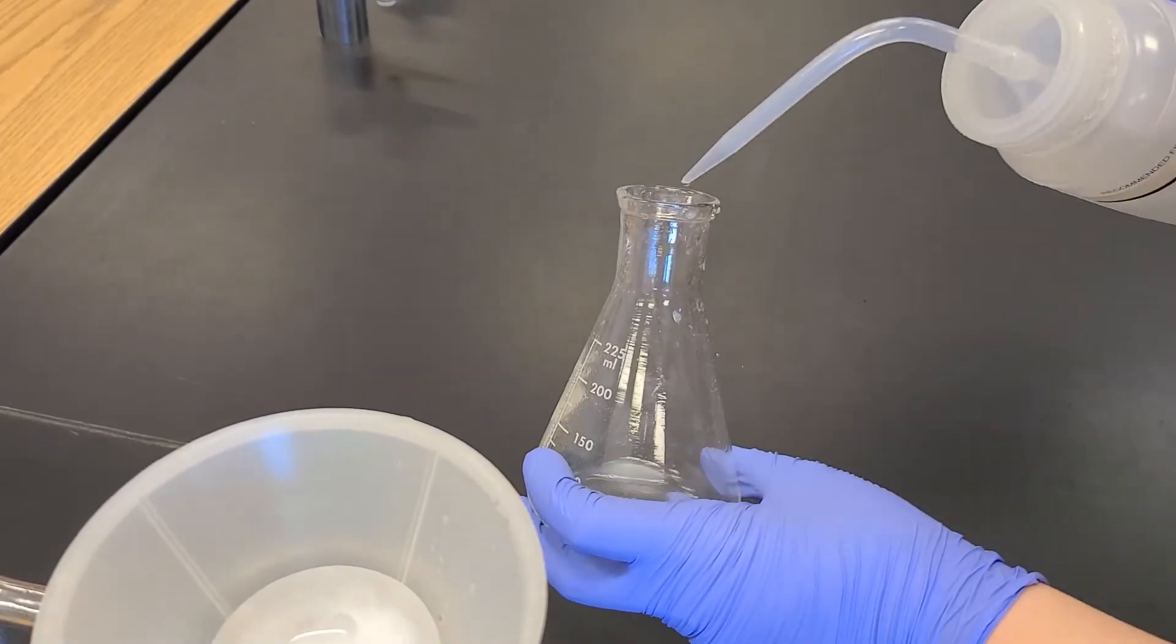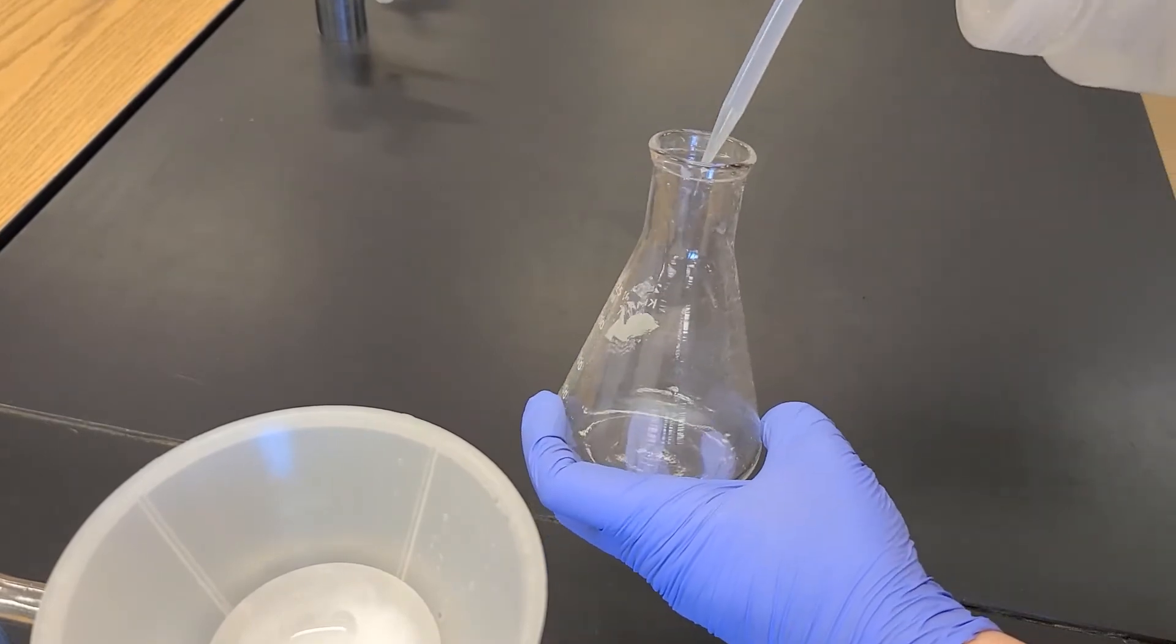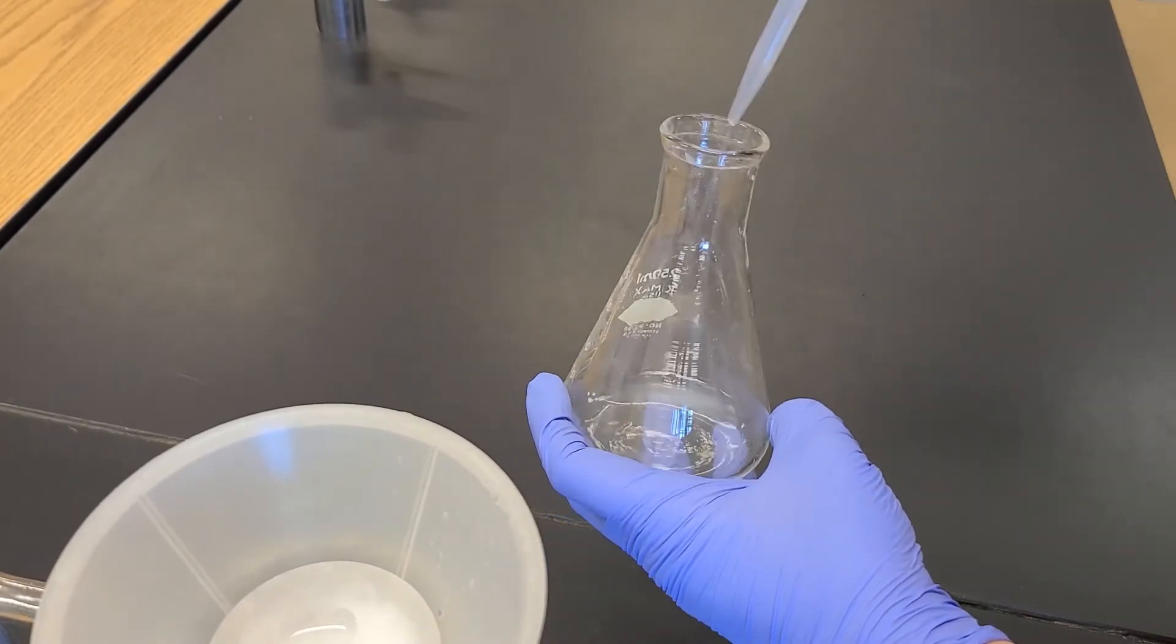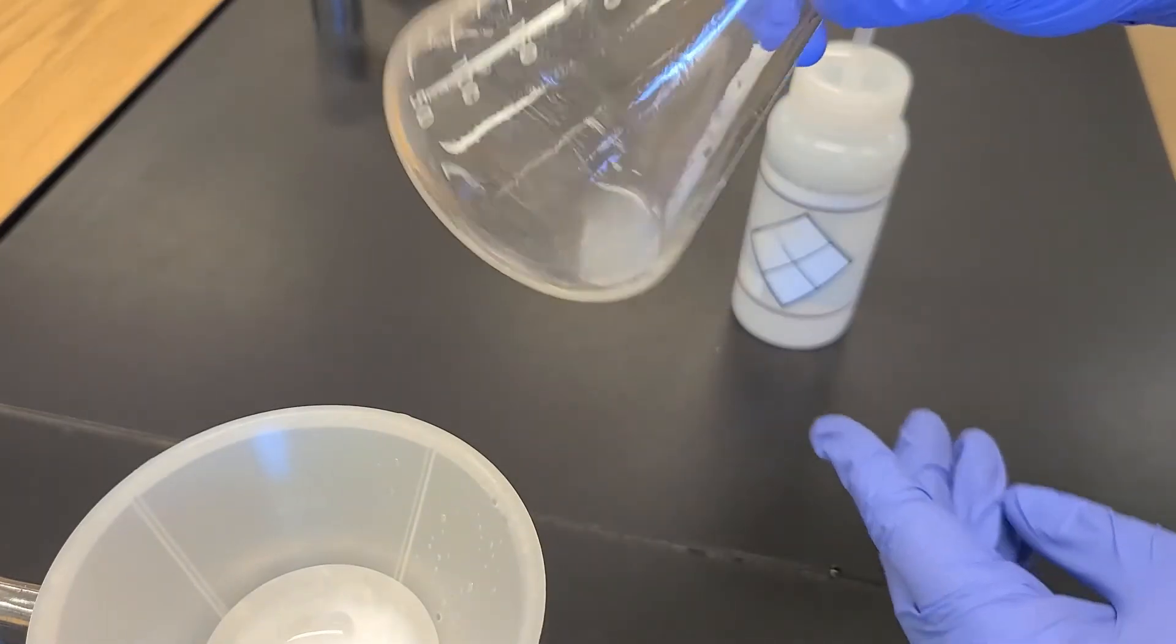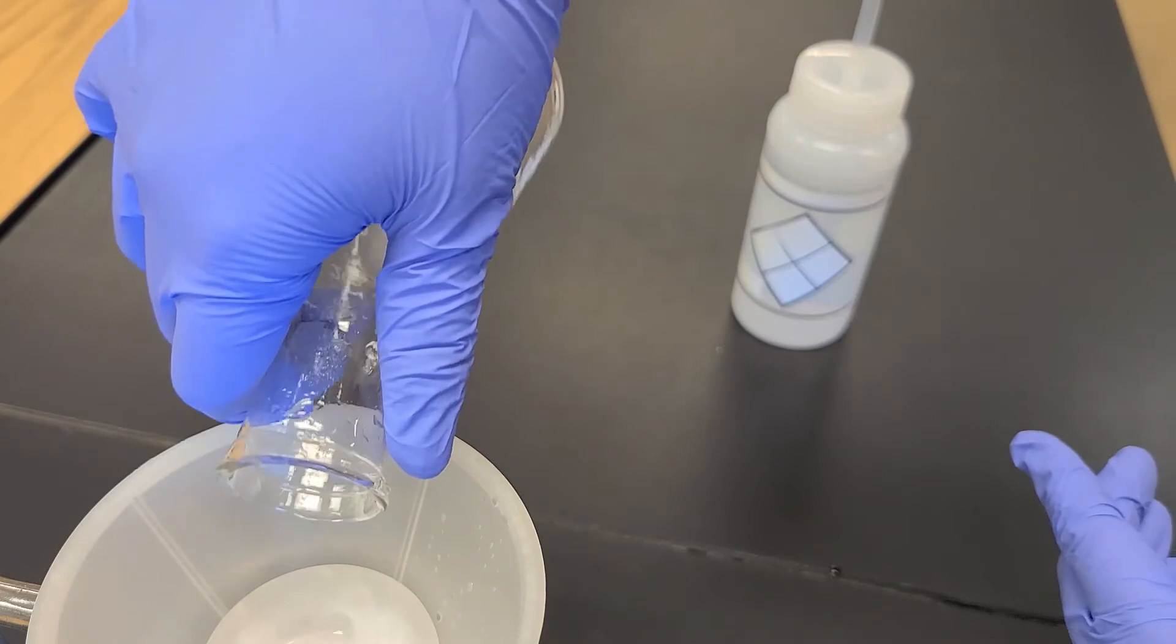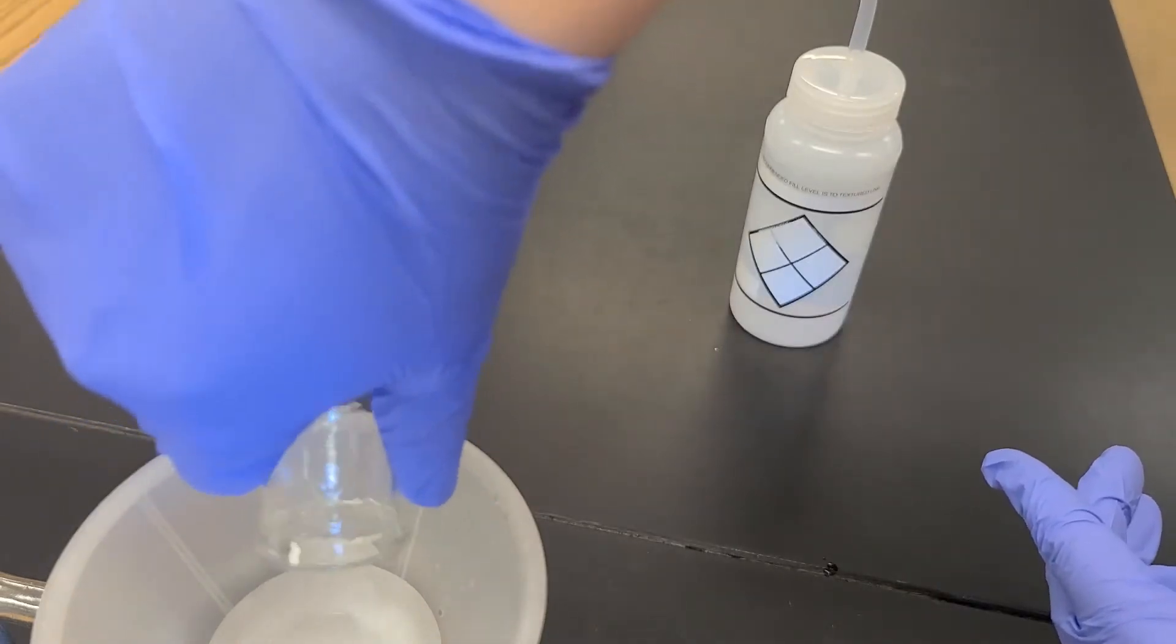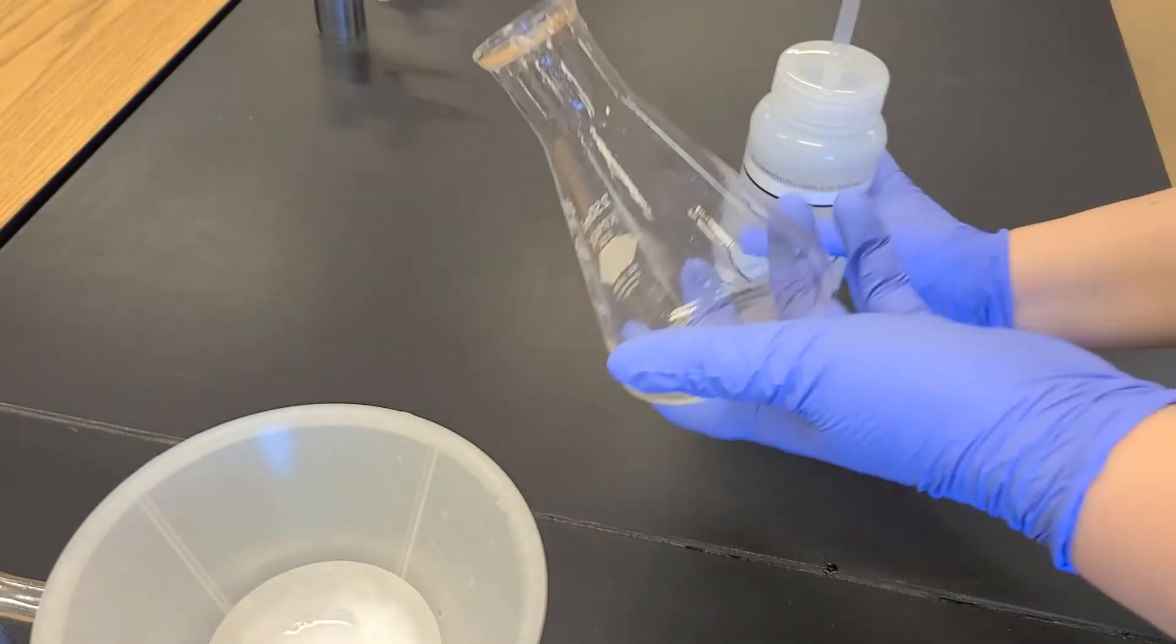I'm going to use my wash bottle here just to rinse down the sides and try to get all of that precipitate off the sides of the glass. I'm just going to add that to our mixture. I'm going to do it one more time.